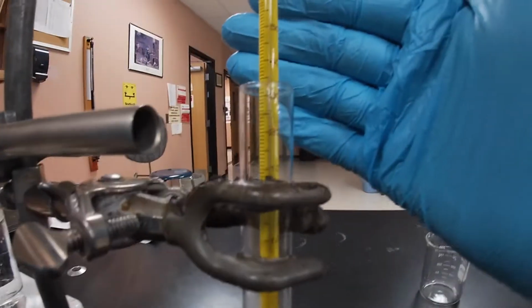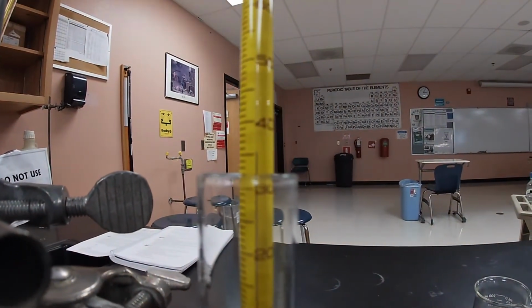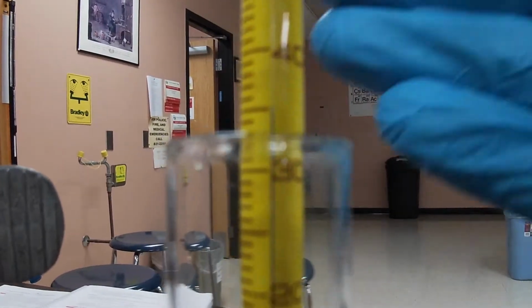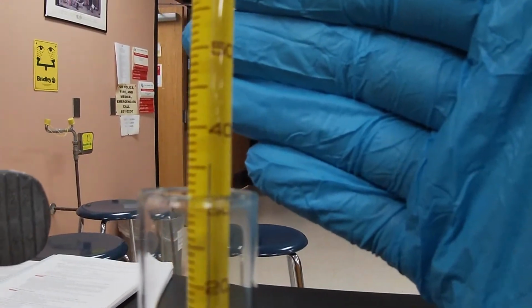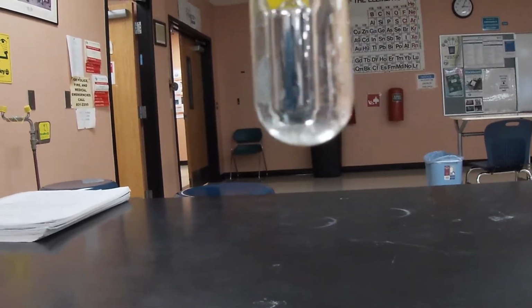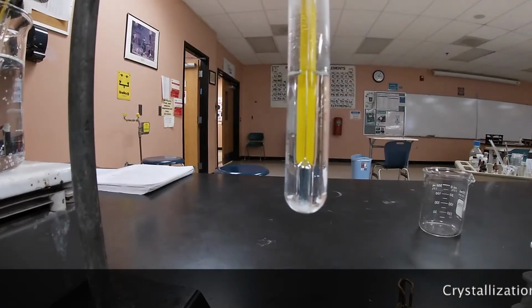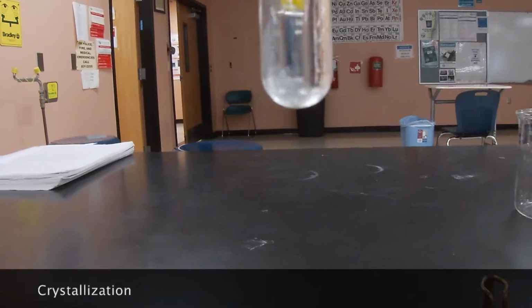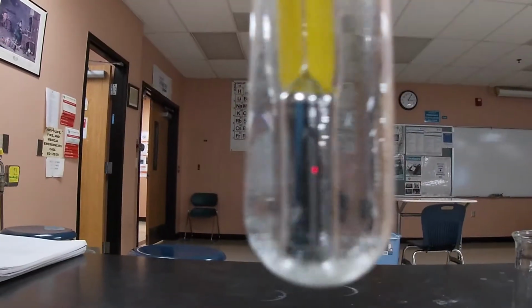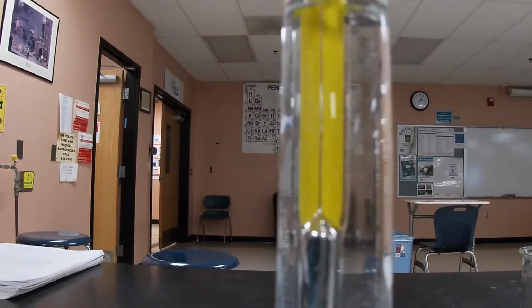And so let's go ahead and record our temperature. Our temperature right there is somewhere around 40. Be at 35. And so again, I'll stir slowly so that hopefully you can see that crystal formation. As you zoom in, you can see the crystals forming. And like I said, it was at the temperature of about 35.